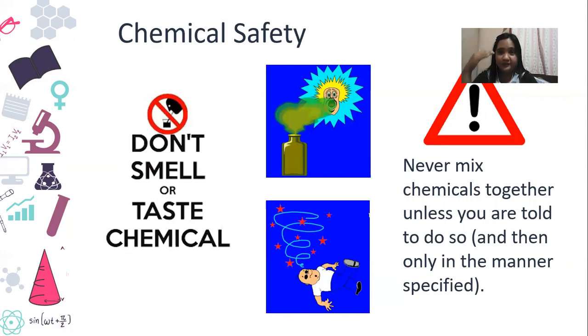Only follow the steps laid down in the experiment. Say, for example, your experiment only has 6 steps. You still have chemicals left, and out of curiosity, you want to mix them, please don't. Do not mix those chemicals, just dispose of them. Okay?